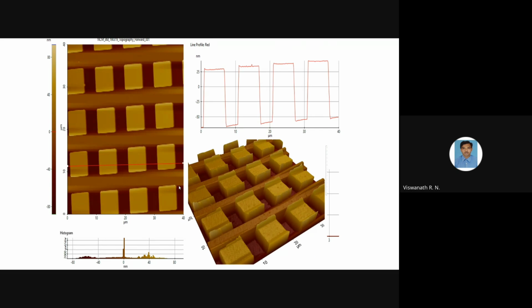If I have a structure like that, for example, a mesh-like structure, with some conducting domain that some people grow, and there is a free region. Now I scan the region. When I scan the region, I can see the height, from the bottom to this way.